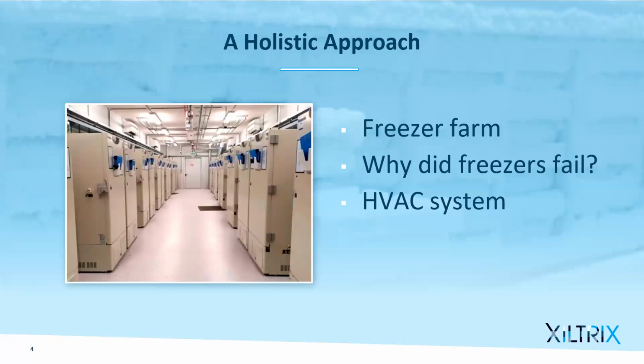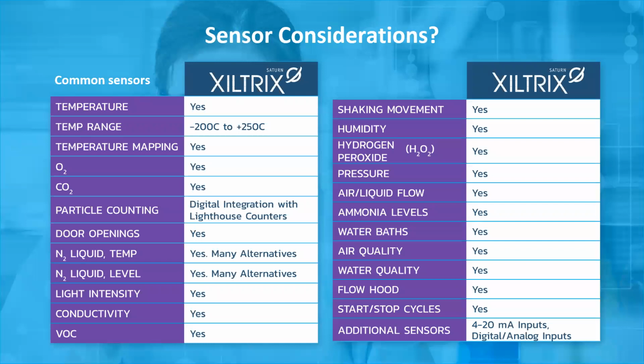So from this, we need to look at what you need to do more and what kind of sensor information is going to be appropriate if you want to do more than just the basics. So we've put together a small list of sensors to actually consider when you want to move from this little example into the future. So if we take a look at the next slide, maybe you can take this, Stephen.